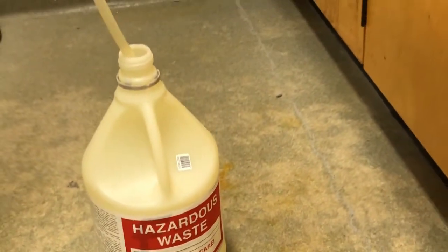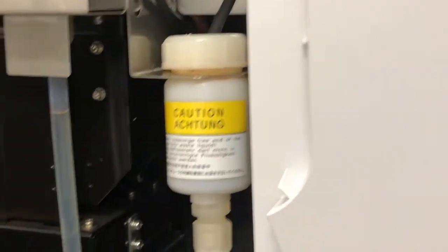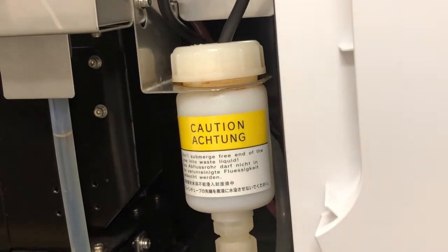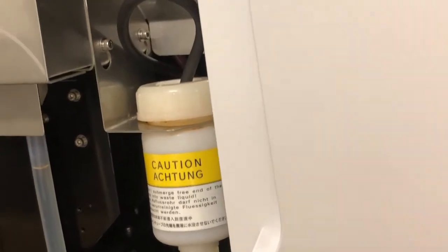And that collects all of the waste that comes out of the machine. So excess solvent and anything else that comes out as waste, so it doesn't go into the environment and we can dispose of it properly, okay? So that's the drain sensor.